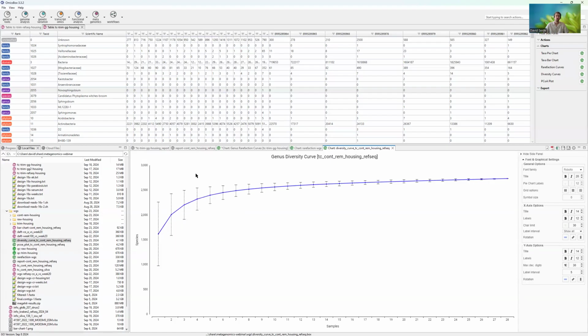Steep curve at the beginning and then asymptotic. The maximum hits stays on the same level. So this data set was sequenced with enough depth. We can say that. Okay, so then we have the numbers here and we have the rarefaction. That's fine.